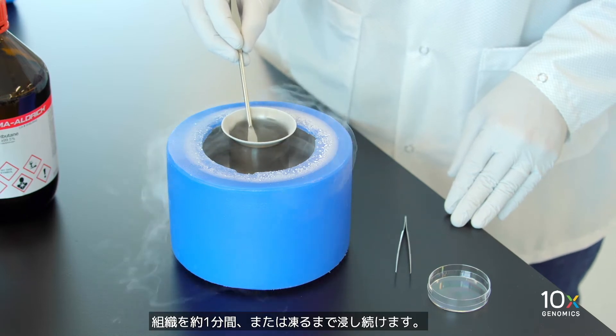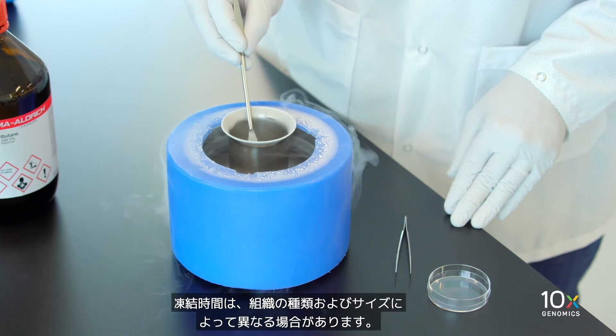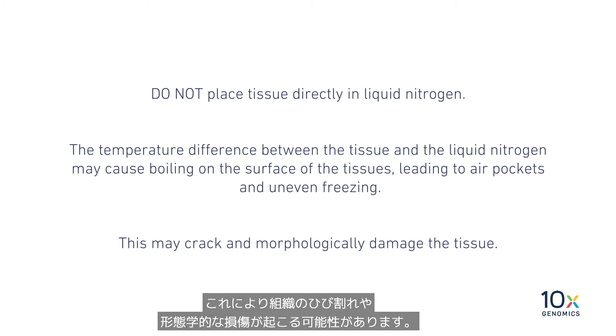Keep the tissue submerged for approximately one minute or until frozen. The freezing time may vary based on the tissue type and size. Do not place the tissue directly into the liquid nitrogen, as the temperature difference may cause boiling on the surface of the tissue, leading to air pockets, uneven freezing, and morphological damage to the tissue.